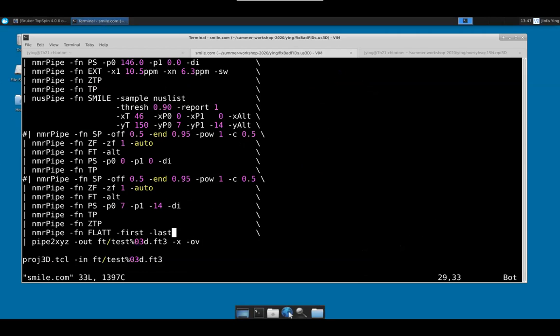Another thing is that you have to set the phase, and this phase is obtained by phasing the regularly processed data. Another thing is this: for standard Bruker data processing, the States-TPPI, you always need to call it alternation, because every other data point you need to negate it, okay? So that you get a correct spectrum. If you have alt for your FT, if you need that to get a correct spectrum, you need X alt or Y alt kept for that dimension.